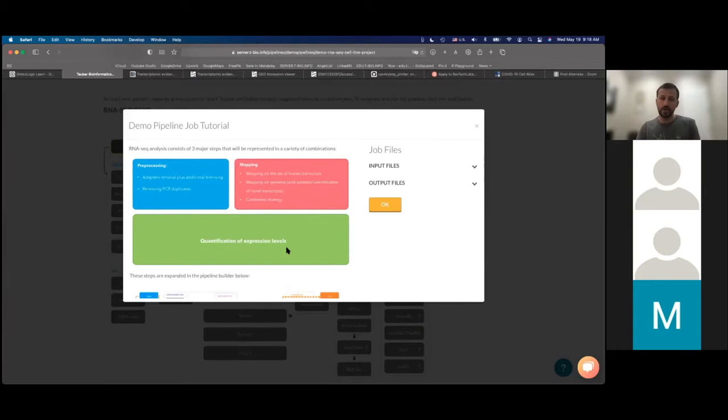Problem number two, the amount of reads has been amplified using PCR. And so because of that bridge amplification, there is a difference in abundance between different types of sequences, because we know that PCR is just biased. Some sequences are typically more amplified than others just because of the type of sequences that they are. And so that represents some technical variation that is not wanted, right? It is going to skew our results, and it might have an impact on our biological interpretation.